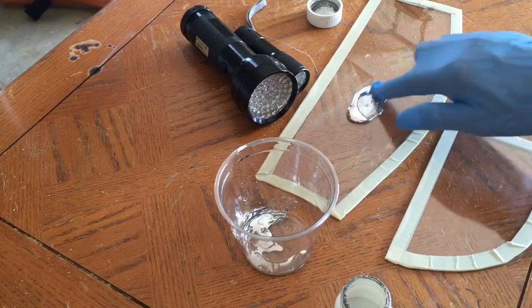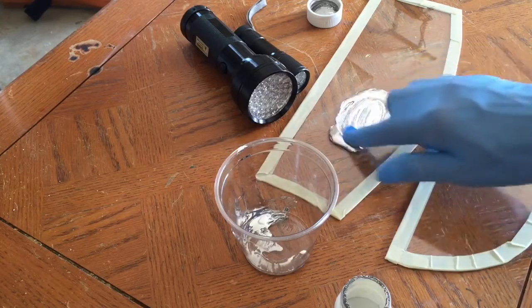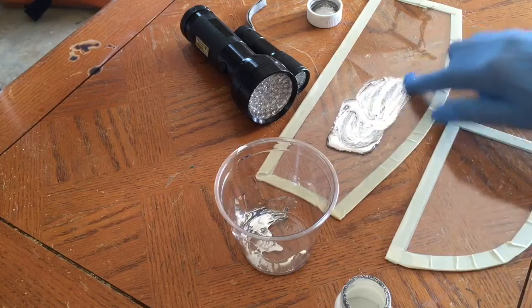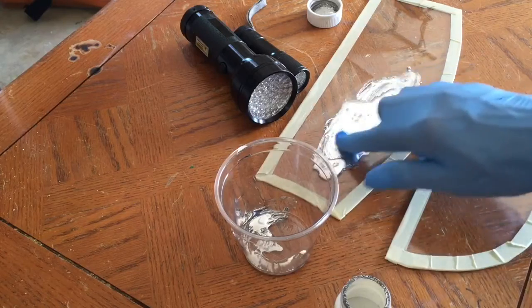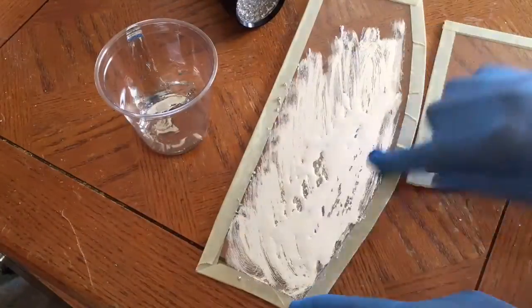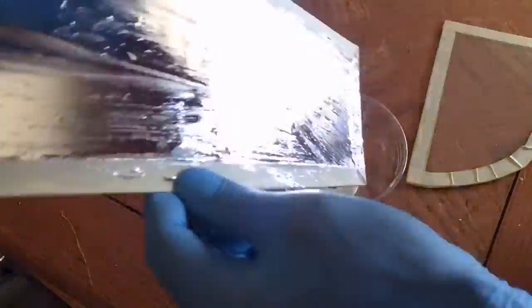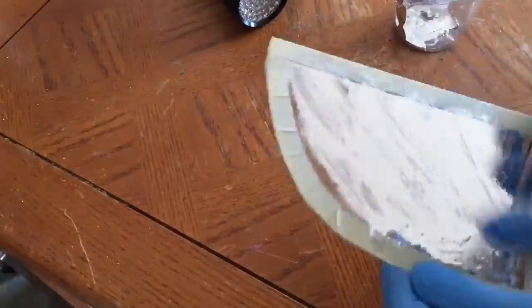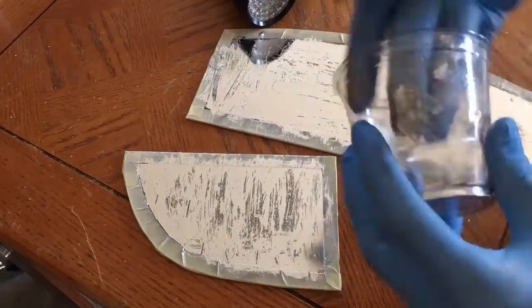Just start slowly rubbing it into the glass. As you can see it's forming a mirrored layer over the glass surface. Let's fast-forward through this and be back in a second.